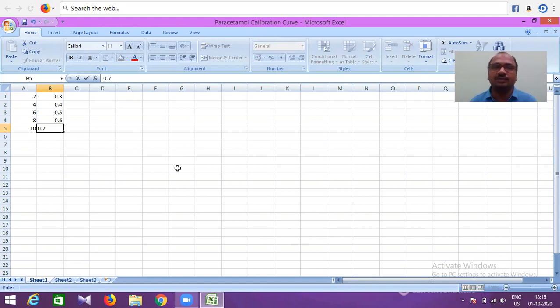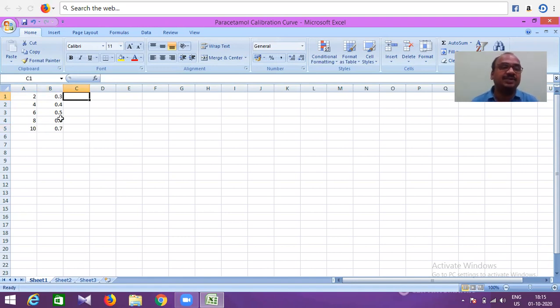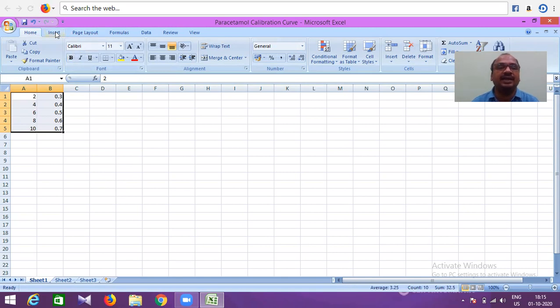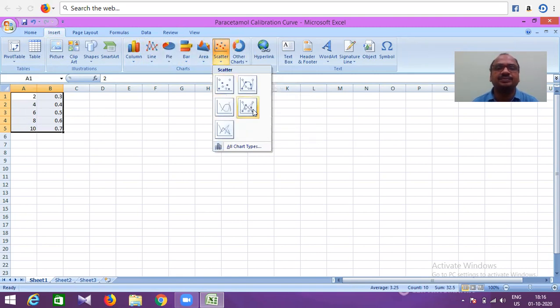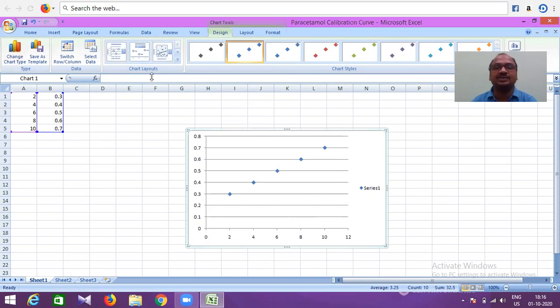Now, select both columns—this is absorbance and this is concentration. Select everything with your mouse or cursor, go to Insert, then Scatter plot. I got this plot for these values with X-axis and Y-axis.